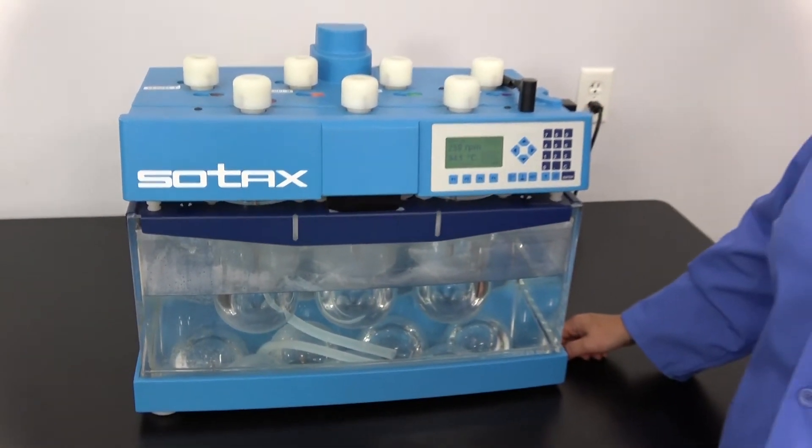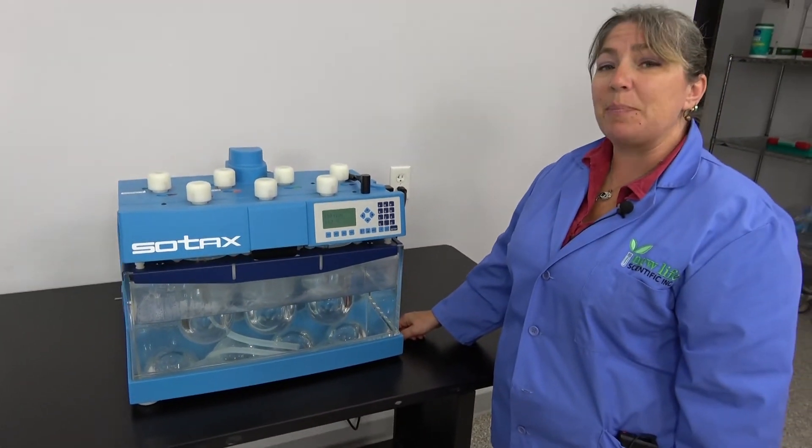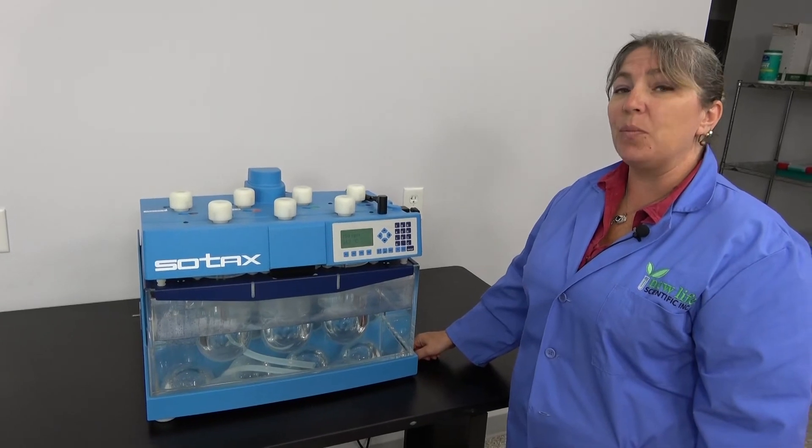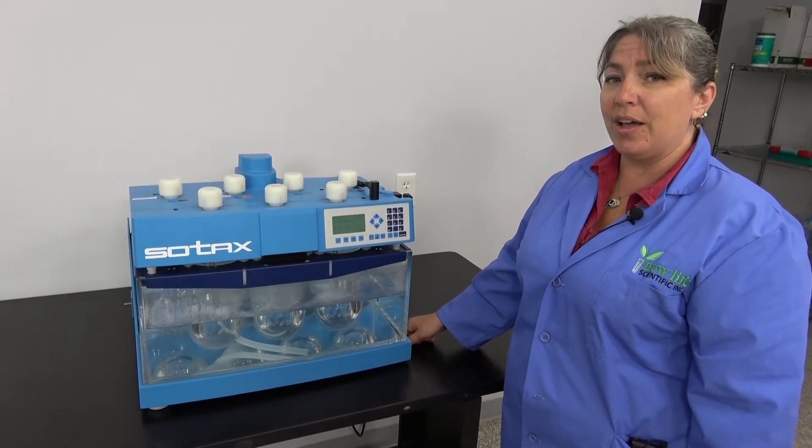This unit has been thoroughly checked out by our in-house technicians. It is backed by our 90-day warranty and we do have it on hand in our Cartersville, Ohio facility.